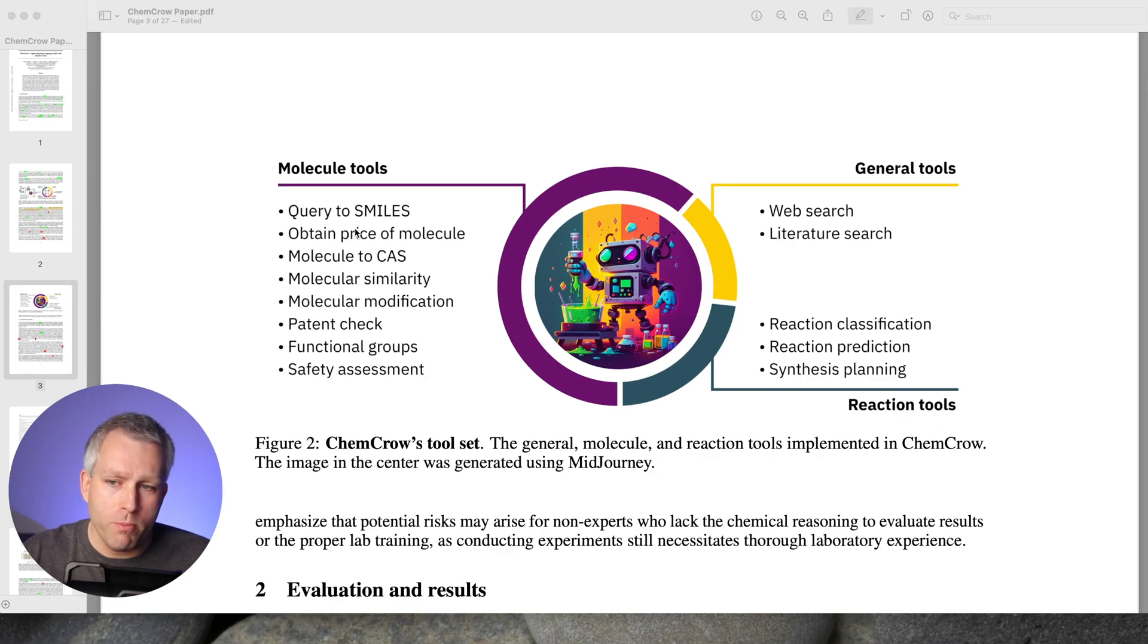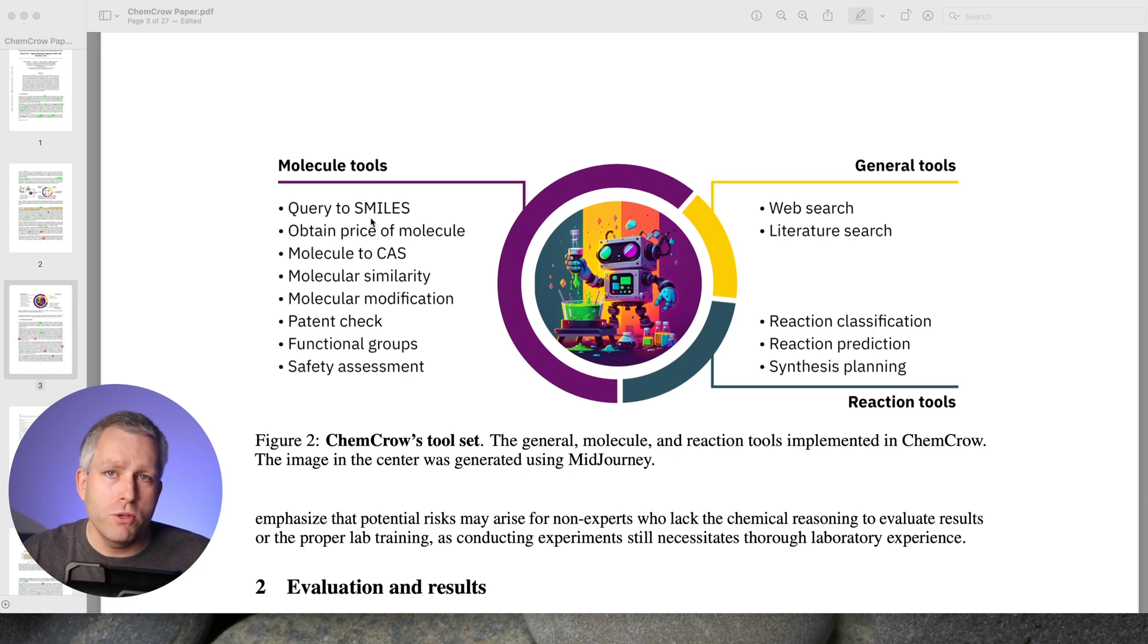Molecule tools are super important because without it, I found GPT-4 is really lost, particularly converting chemical structures into SMILES, which is a format that computers use when they work with chemical structures. Then obtain price of molecule, that's pretty self-explanatory. Thermomize molecule to CAS. CAS is a unique identification number for chemical compounds. It's very useful if you're doing other searches. Molecule similarity, molecule modification, they can do patent check, and also look at functional groups.